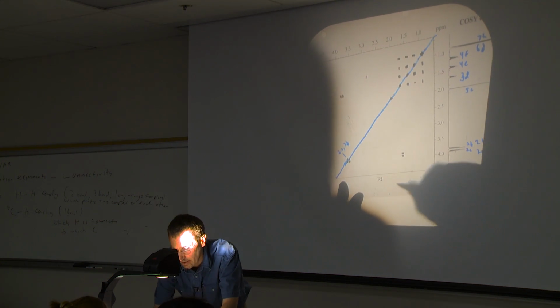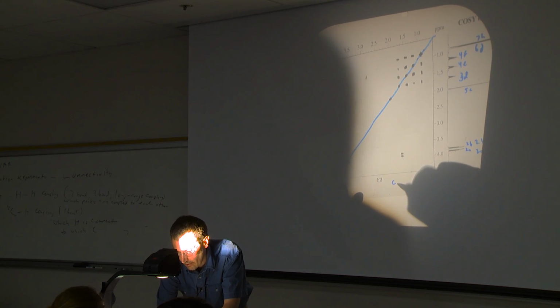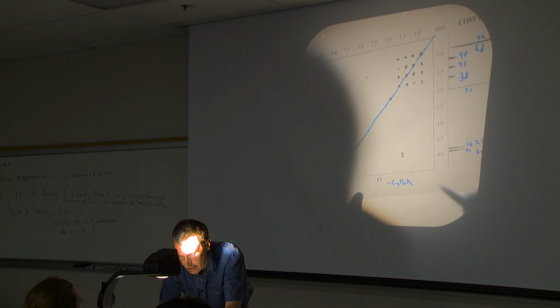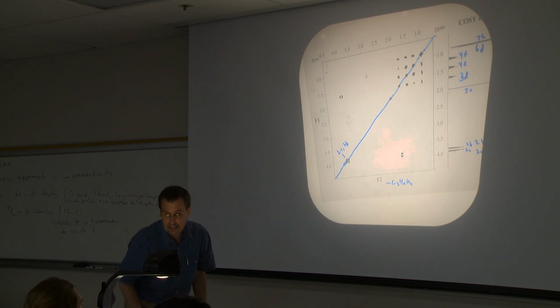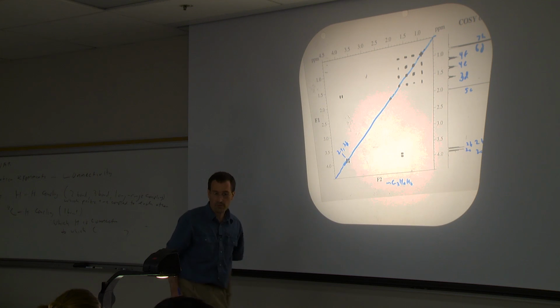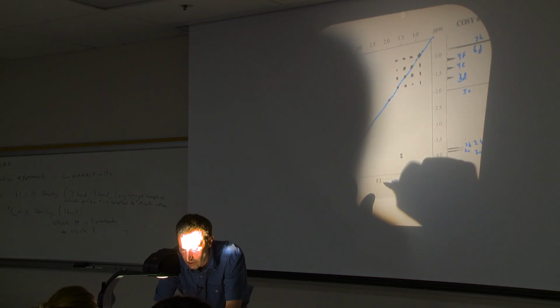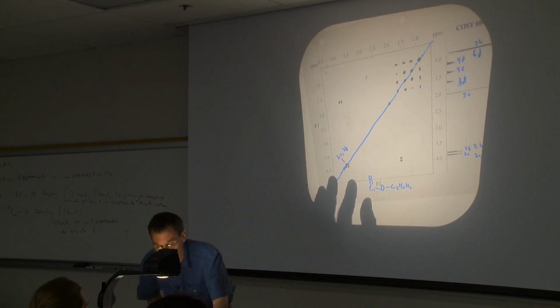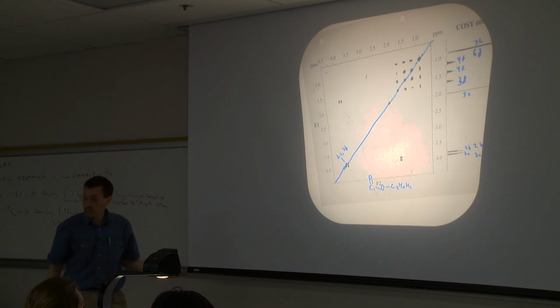So that's not really useful. And remember, carbon 2 is the one that is downfield in the C13 NMR, and it's the one with the methylene group that we think is connected to the oxygen. And we believe that the oxygen is part of an ester, and that ester has carbonyl number 1 to it.